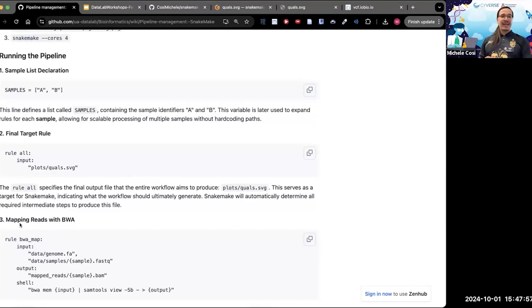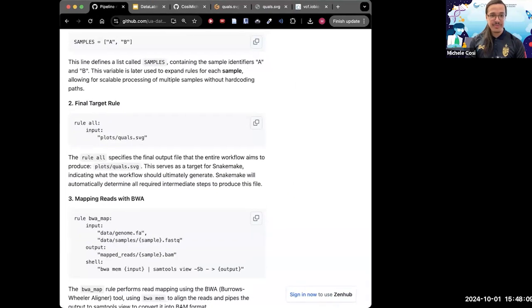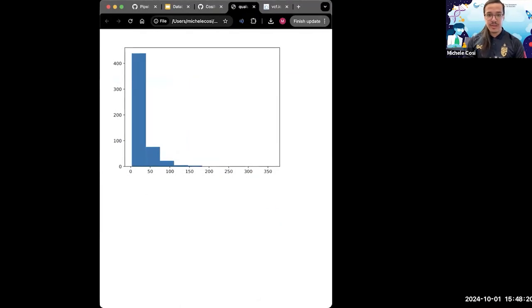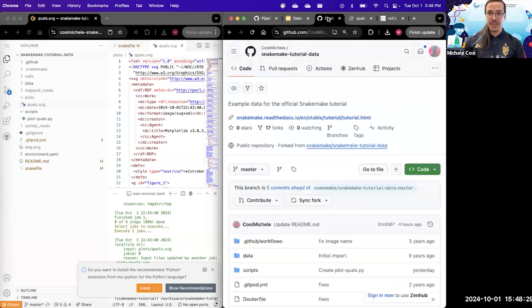Let's forget about our awful little plot, and let's look at what we ran. I like to do a little exercise now where I make this a little smaller, close this up, and open this to the left. I have to do a new share. Okay, you should be able to see my entire desktop now.